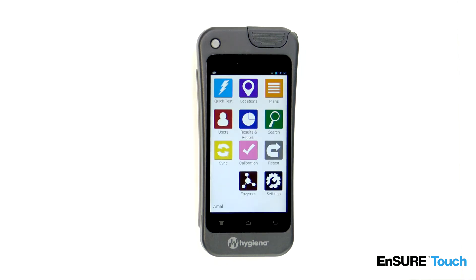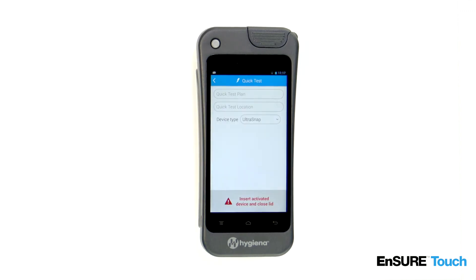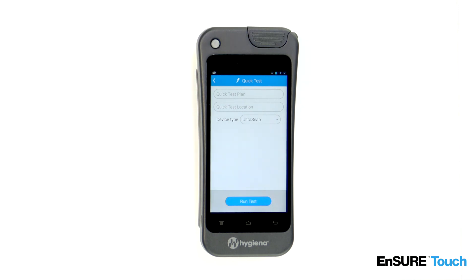Let's get started. To run a quick test, touch the quick test icon. Open the lid. Insert the test. Close the lid. Touch run test.